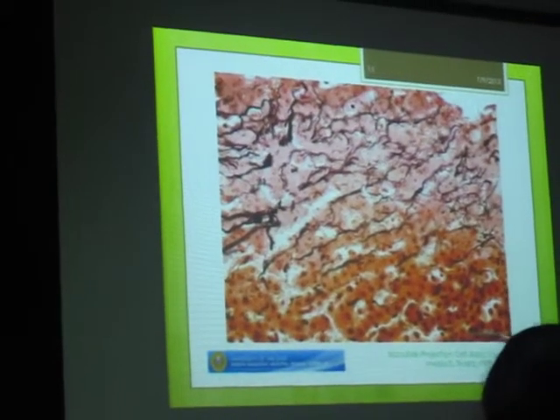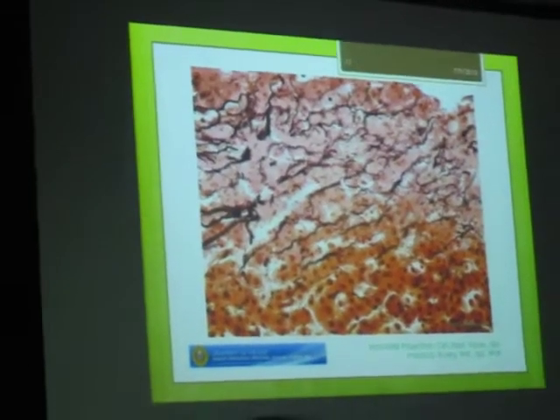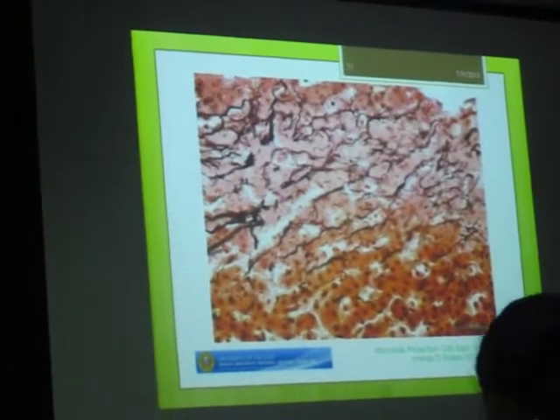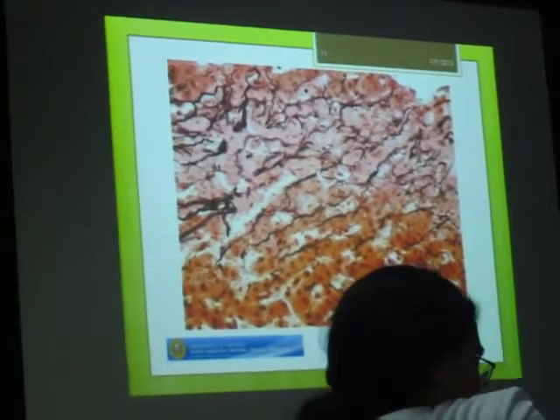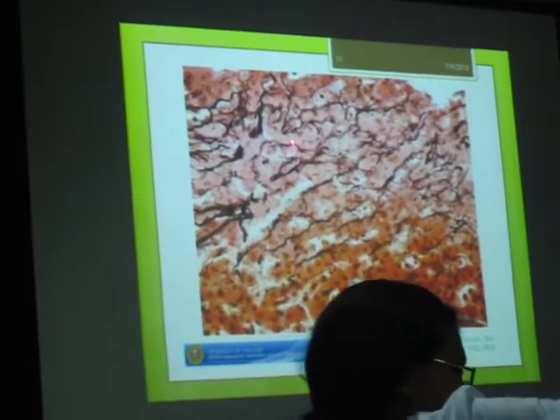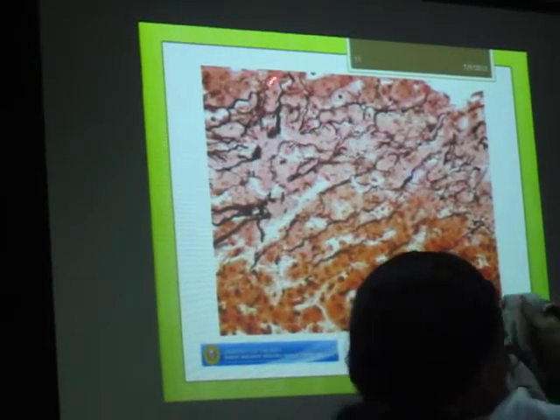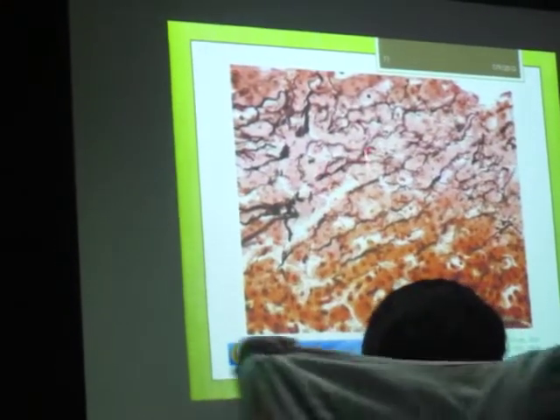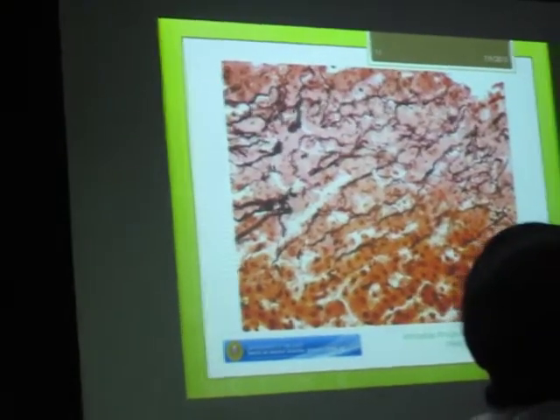Because if you look first, this is liver. Example lang, liver. You will write down liver. But that is not what is asked. If you are just asked to identify the pointed structure, reticular fiber. If classify the pointed or bracketed tissue, that's reticular tissue.